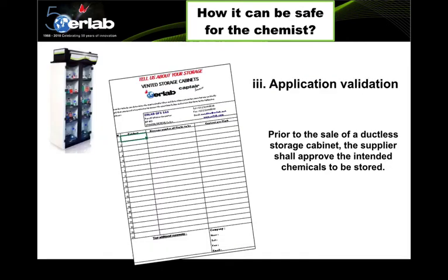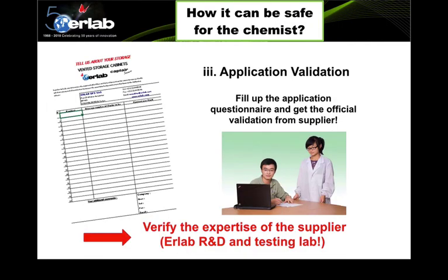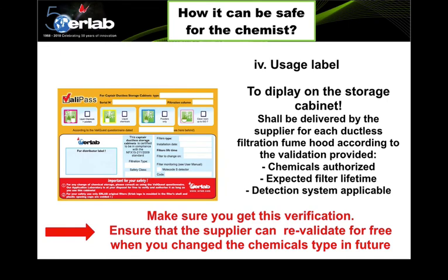Requirement three is application validation. A responsible manufacturer should provide validation for the type of chemicals you intend to store in the ductless storage cabinet, approve it, and be accountable for it. Once you fill in a questionnaire, the manufacturer validates it to ensure the system is suitable for your chemicals. Requirement four is the use of labeling — the label displays the chemicals authorized to be stored, the expected filter lifetime, and the applicable detection system for that cabinet.